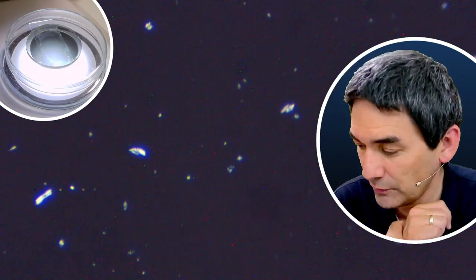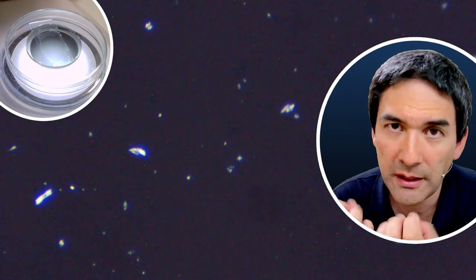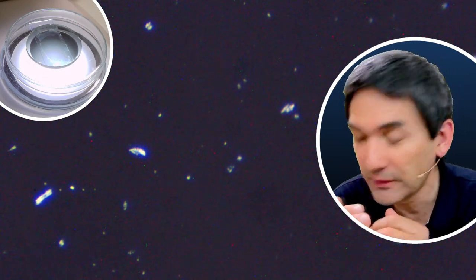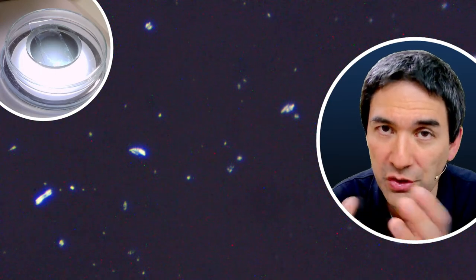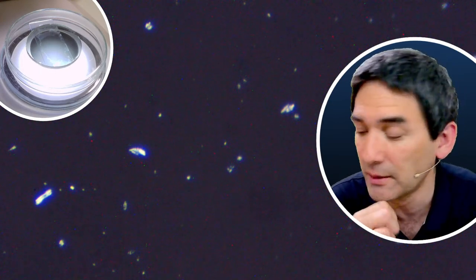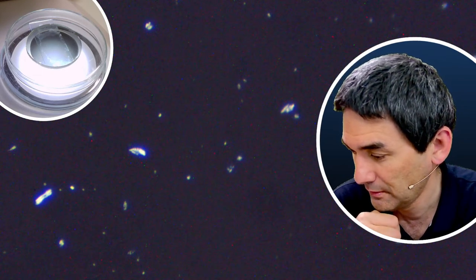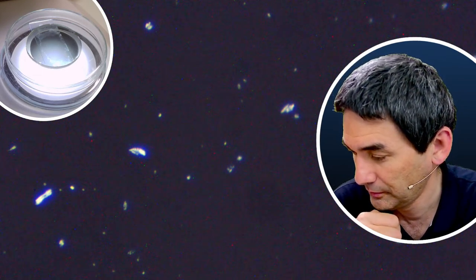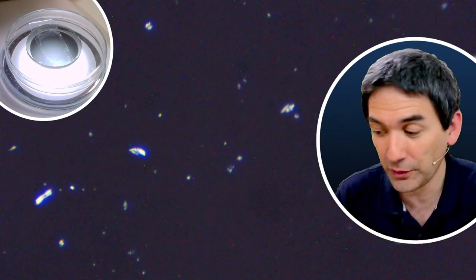It could also be, and that's something you have to keep in mind, that the alcohol and also the substance attract moisture from the air. And this can also delay the crystallization a little bit as the moisture from the air starts to be soaked up by the substance. Okay. Yeah. I'm waiting now. I'm not going to touch this.